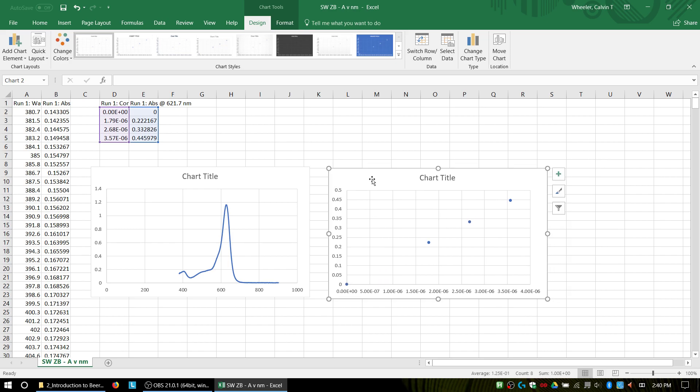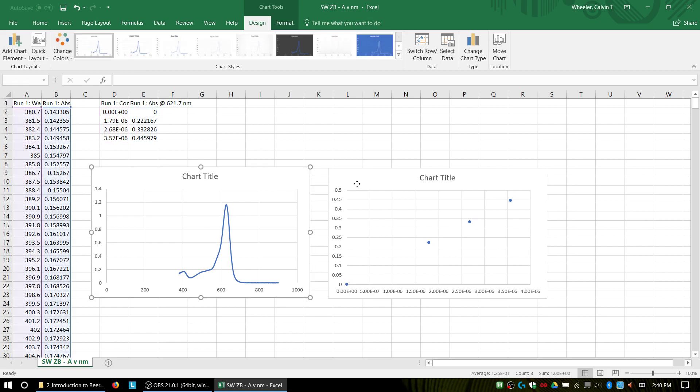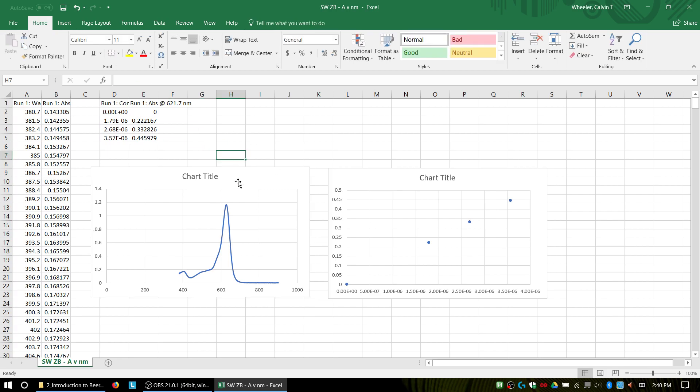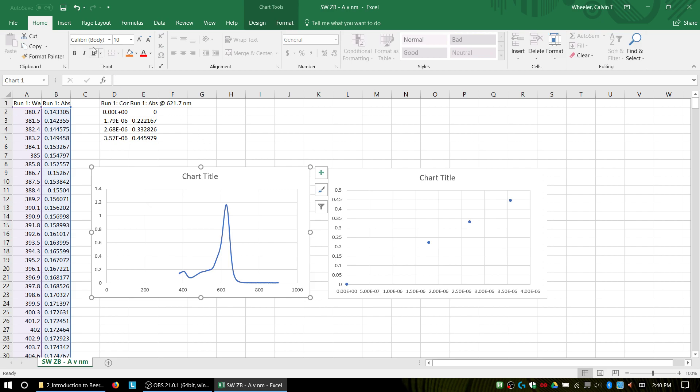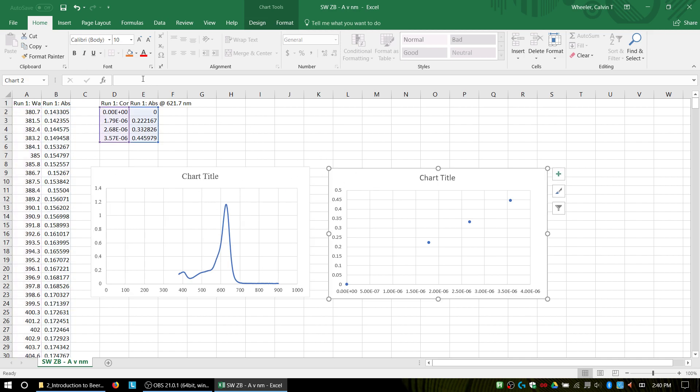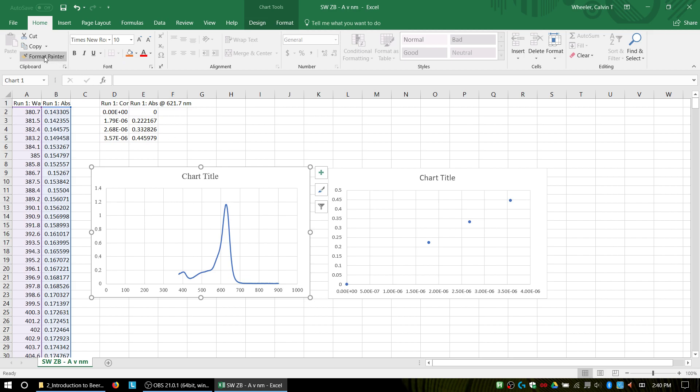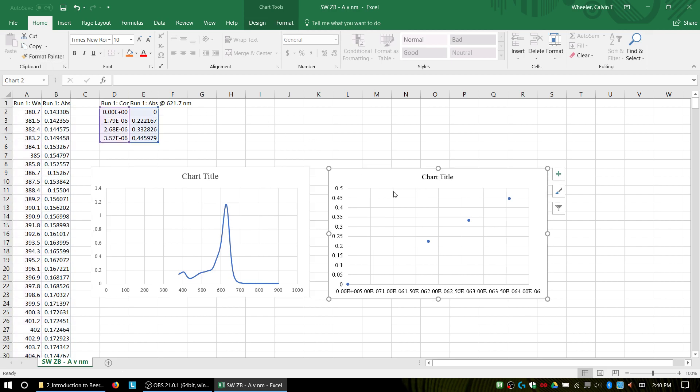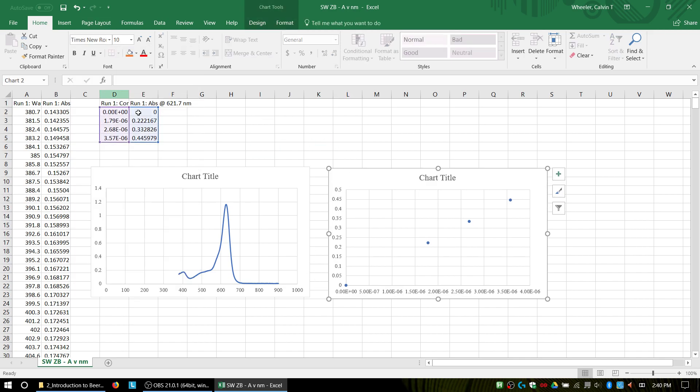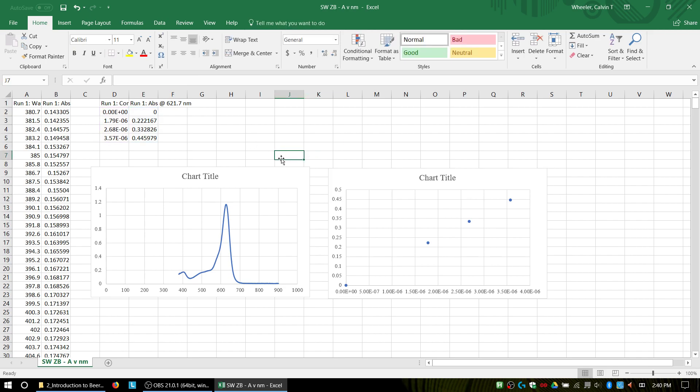There are a couple of things that we want to do right out the gate, and that's the first thing we want to do is we want to change their fonts to Times New Roman. I guess you can only do one at a time, so let me click on the first one. So change from Calibri to Times New Roman, there you go. And I can do that for the same one. I can also take Format Painter, so I select on my chart, I hit Format Painter, and I click here, and it changes the formats to match. So that will accomplish the same task.